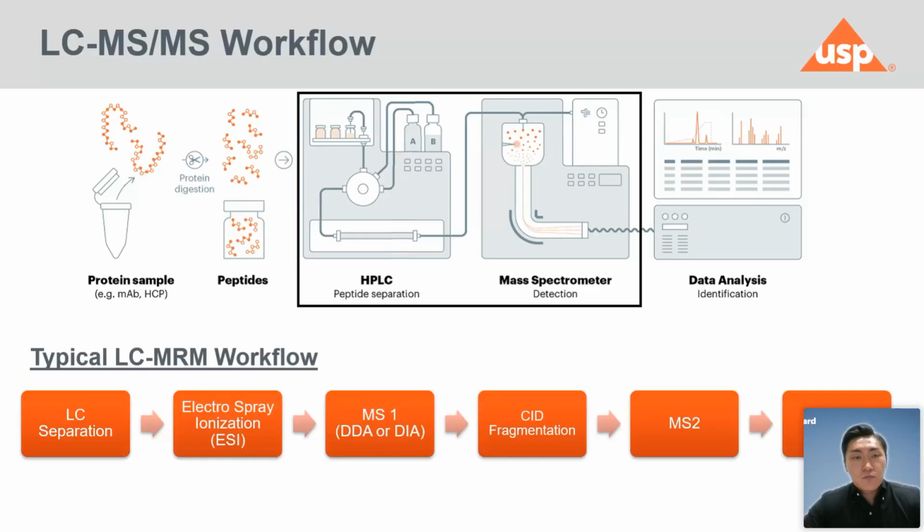And then the second part of the chapter that we really dived into for this presentation is the mass spec workflow.